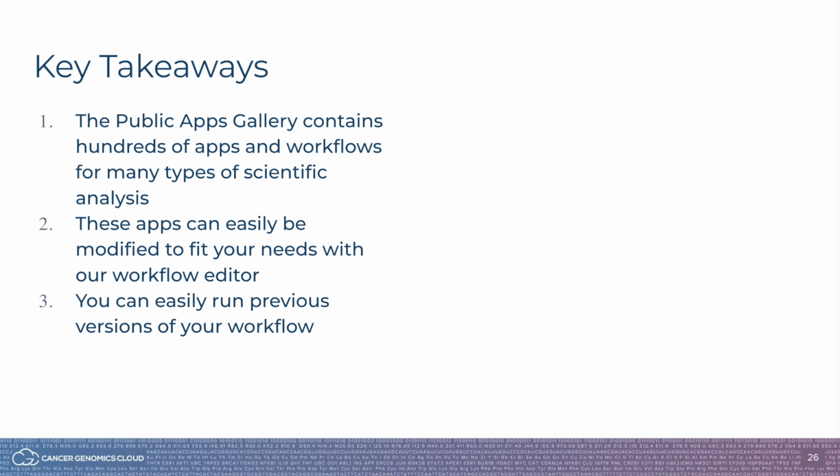I hope you now have an understanding of how to modify a workflow. Some key takeaways to keep in mind are 1, again, the public apps gallery contains hundreds of apps and workflows for many different types of scientific analysis. I showed you just a few today. 2, these apps can be easily modified to fit your needs with our workflow editor. And 3, you can easily run previous versions of the workflow.